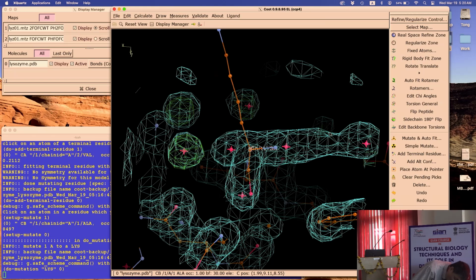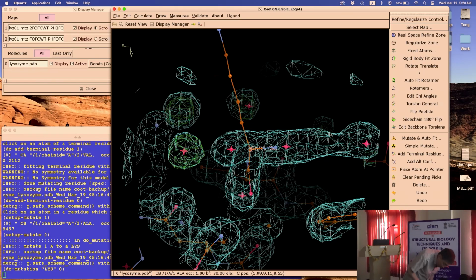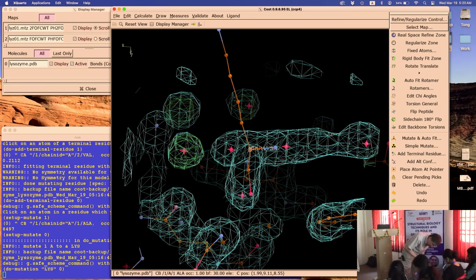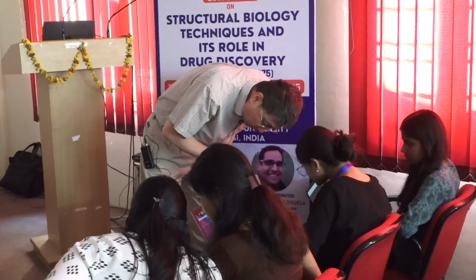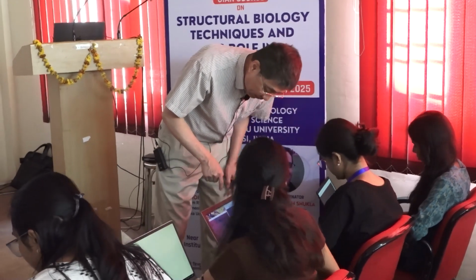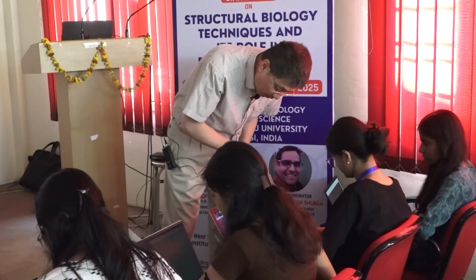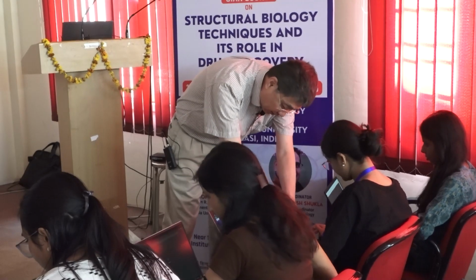Oh, you're not in the first residue. So go to, push spacebar, see what happens. There you go. No, once, not too many times. Which residue is that? I can't read the label. What does the label say? Yeah, you had to go back. So no. Shift spacebar, go back. No, hold shift down and then space at the same time. You should go back. No, shift space.